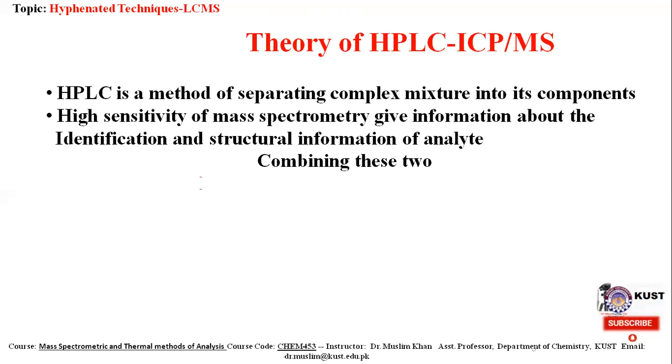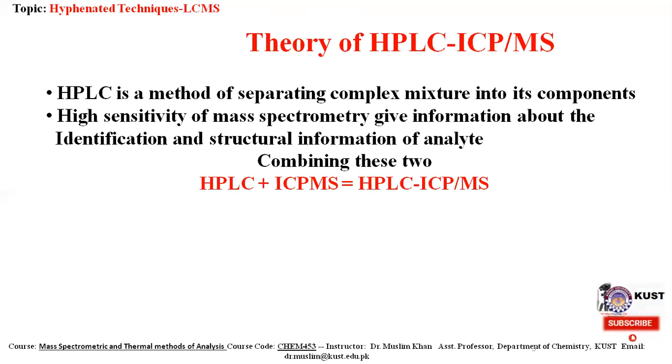So, combining these two, HPLC plus ICPMS, we get a hyphenated or coupled technique known as HPLC-ICPMS.